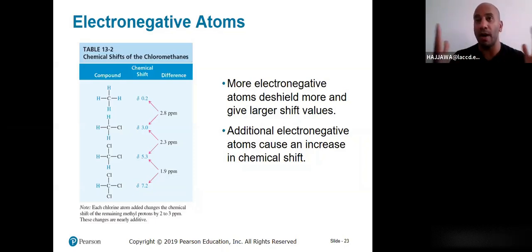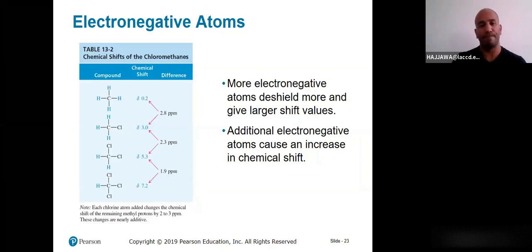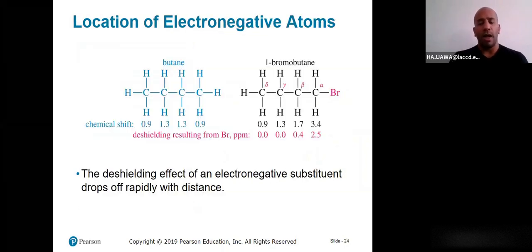So this is important. When I'm giving you a spectrum and you see a peak at 0 ppm, don't look for a part in the molecule that's going to read at 0 ppm. That is the TMS. That's just used as a reference. If you see a peak at 7.2, most likely that's the chloroform. That's the solvent that's being used. Here are more examples.